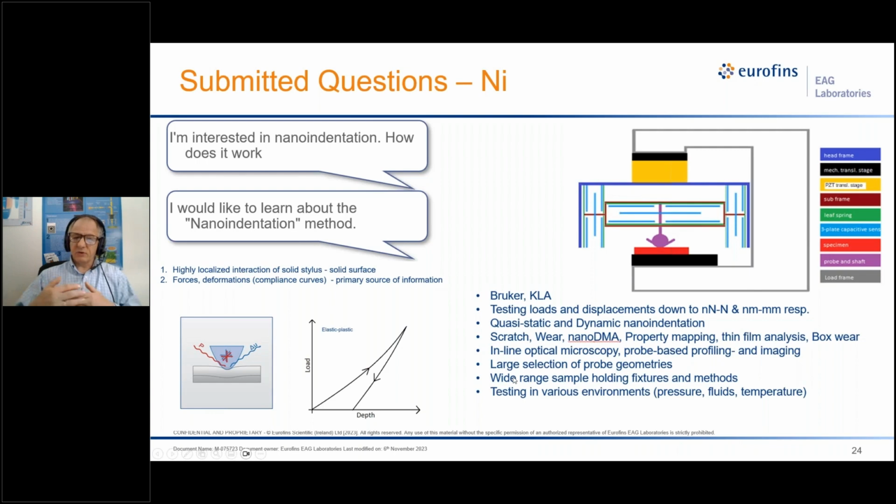We have to mount the samples. There is a wide range of techniques, which are basically also up to the application, and we can do tests in various environments such as under pressure variations, fluid, temperature.